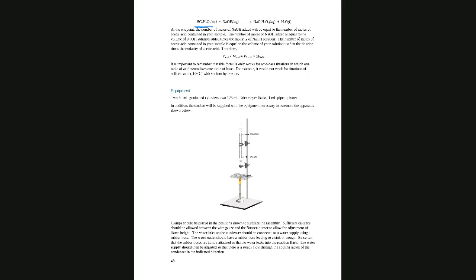But we are interested only in the volume of sodium hydroxide needed to neutralize the acetic acid. So we need to prepare a blank with 20 drops of sulfuric acid, and then we'll take 1 ml and titrate that blank.